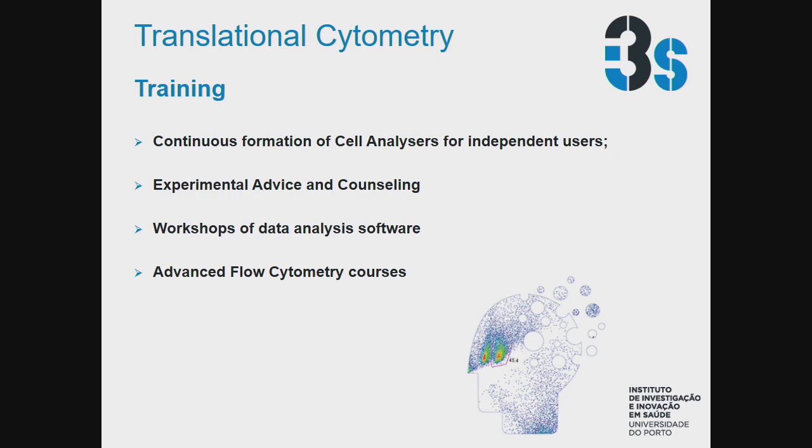Training in our platform is continuous for the users that want to use the cell analyzer. So we have a continuous formation, and then they become independent users of the cell analyzers. We also have experimental advice and consulting. And of course, every year we want to do workshops and advanced flow cytometry courses.